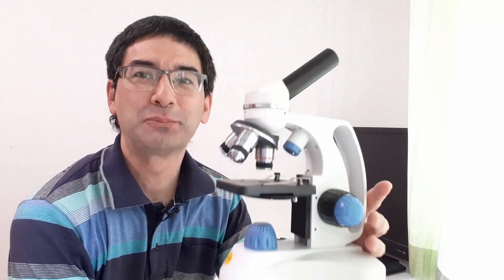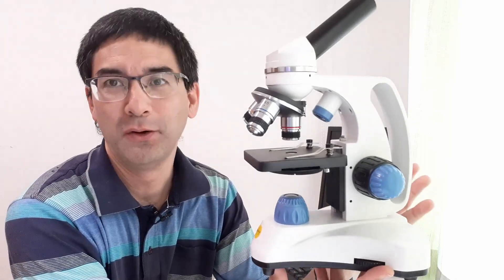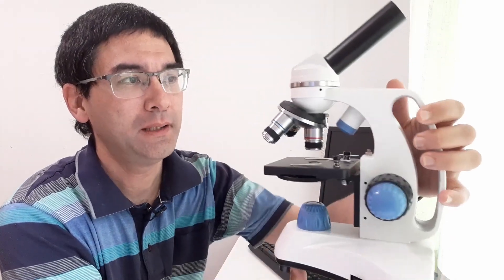Hi, Microbe Hunter here. Look what I brought you today. It is a microscope. Obviously it's an introductory microscope and in this video I would like to introduce it to you.